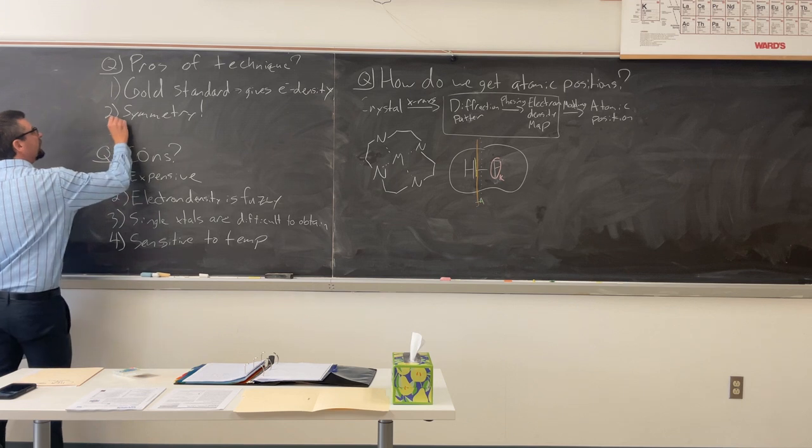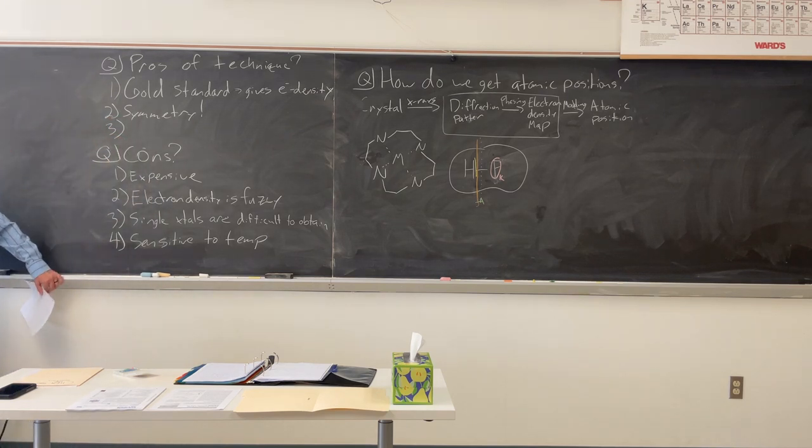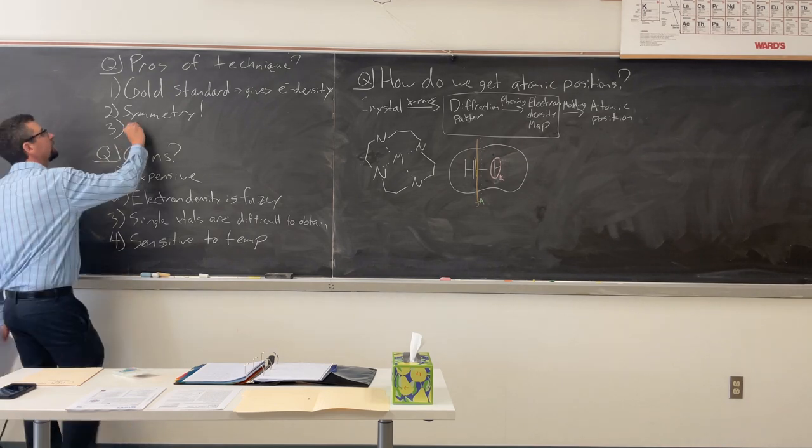One other big pro. I shoot X-rays at my crystal. I turn off the instrument. You don't destroy the crystal. You still have a crystal. It's a non-destructive technique.